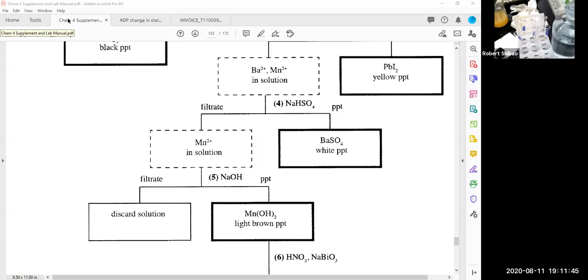Now, fortunately, the lead was mostly as the insoluble PbI2. It's not very soluble, PbI2. So that's a good thing. There shouldn't be much lead in solution. And so this liquid's probably fine; the lead is going to be the precipitate here. So you probably can see that here. There's some on the test tube rack here. So when we clean this up, I'm just going to make sure I have the gloves on, and then I'm going to try to wipe up the solid as much as possible.